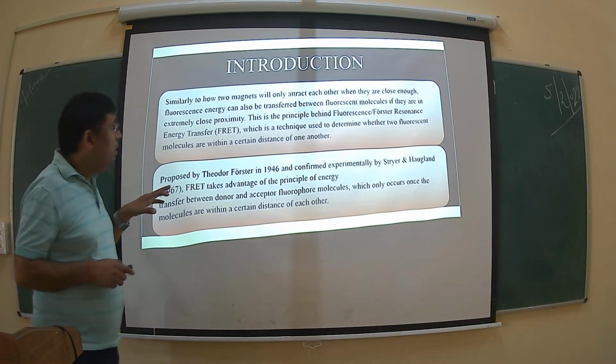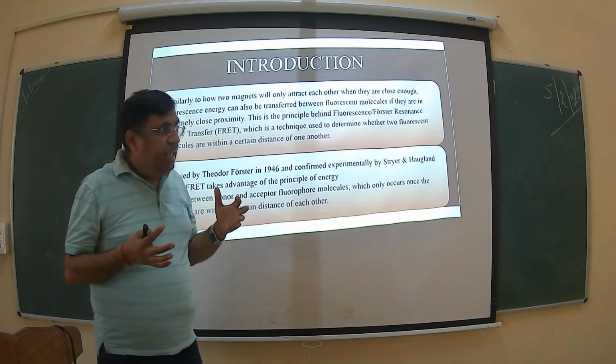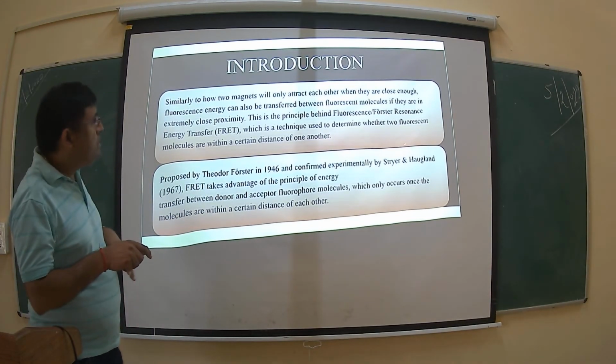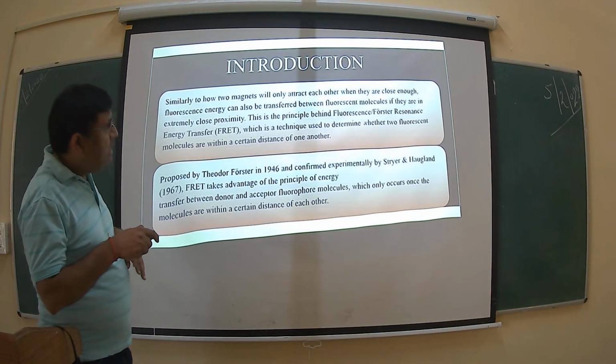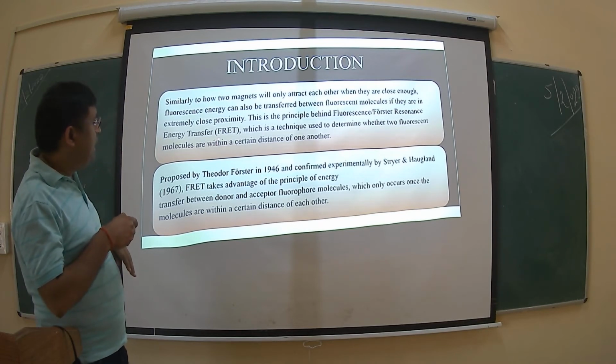FRET is the full form of fluorescence or Förster resonance energy transfer. Okay, so the full form of FRET is fluorescence or Förster resonance energy transfer.